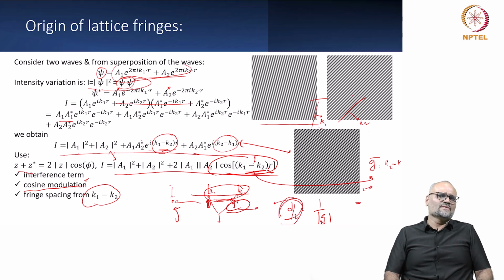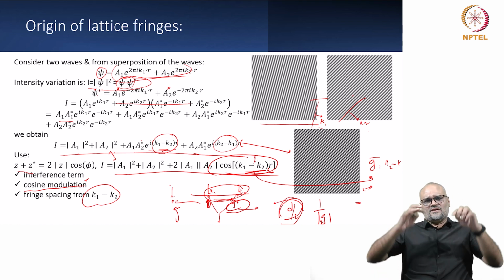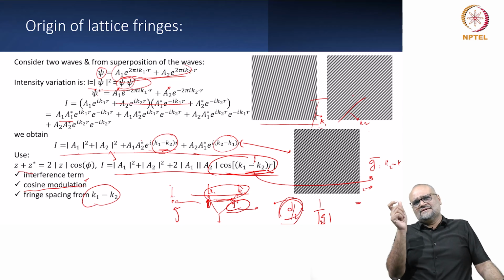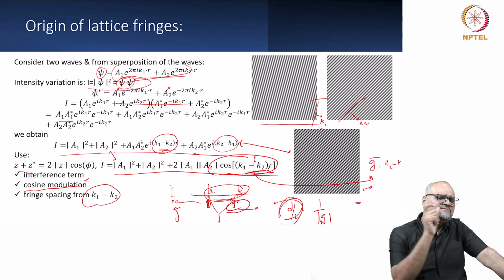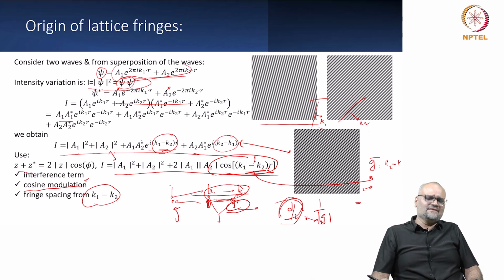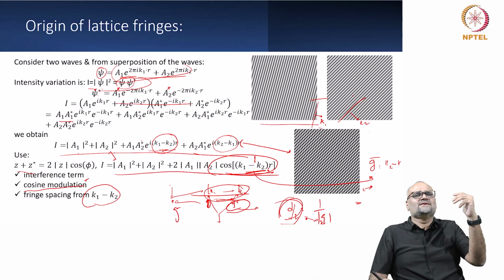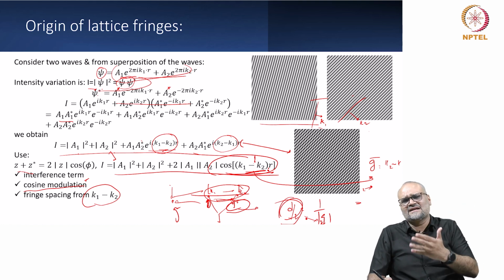So what exactly I am trying to tell you here is, from a two beam interference condition, I get direct measurement of the fringe spacing, but in reality when I have more than two beams, the third beam that comes in actually corresponds to these two reciprocal lattice vectors together, and when I use this inverse relationship, I end up getting half the lattice fringe spacing, which in most cases physically is not difficult to comprehend from a direct image.